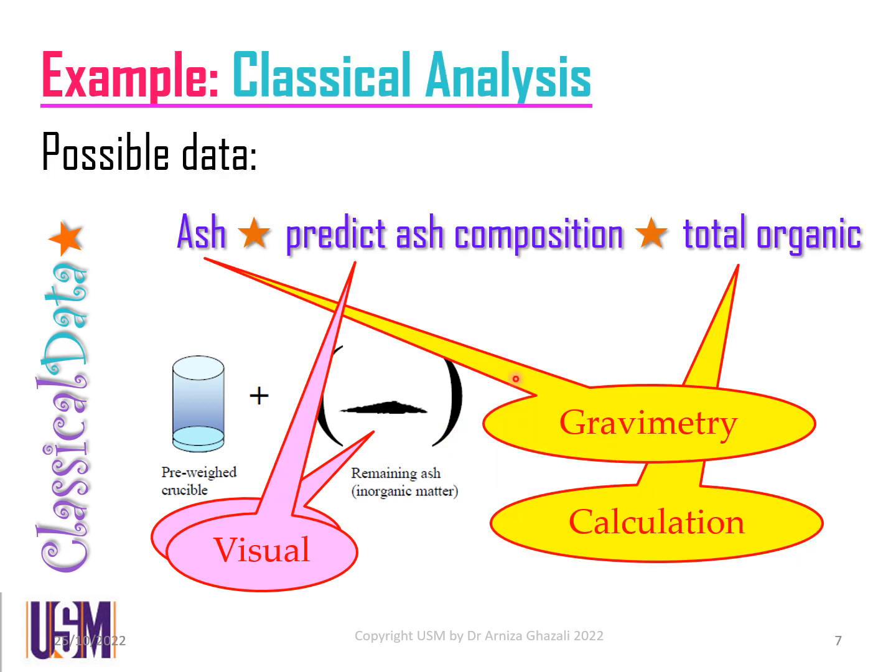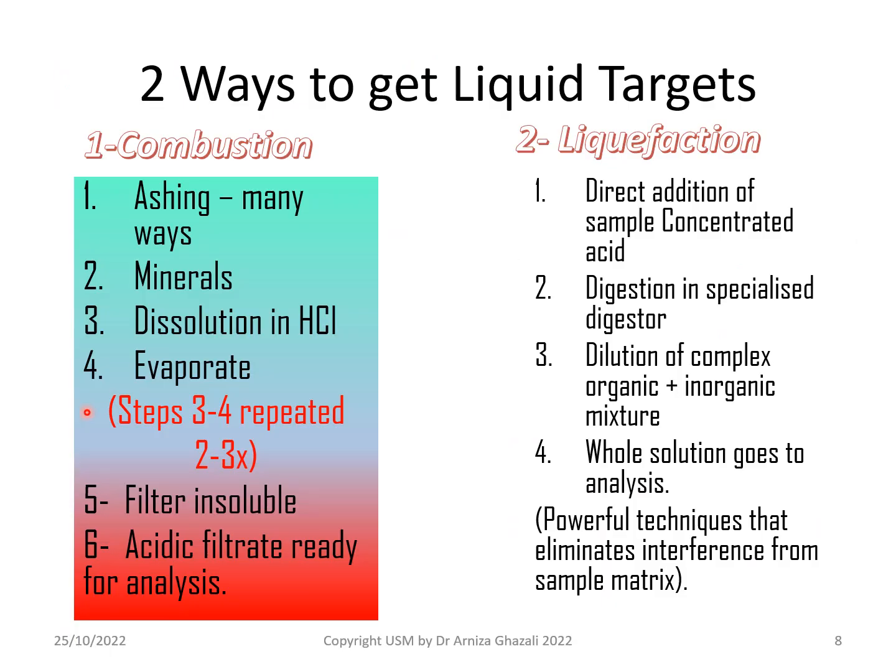So the ash is the residue, so that weight is actually your ash. So percentage ash is whatever residue divided by the initial weight of the cockles times 100. So that's percentage ash. So we begin with gravimetric analysis and obtain gravimetric data, which is percentage ash. So that's one method of extracting out the inorganic analyte.